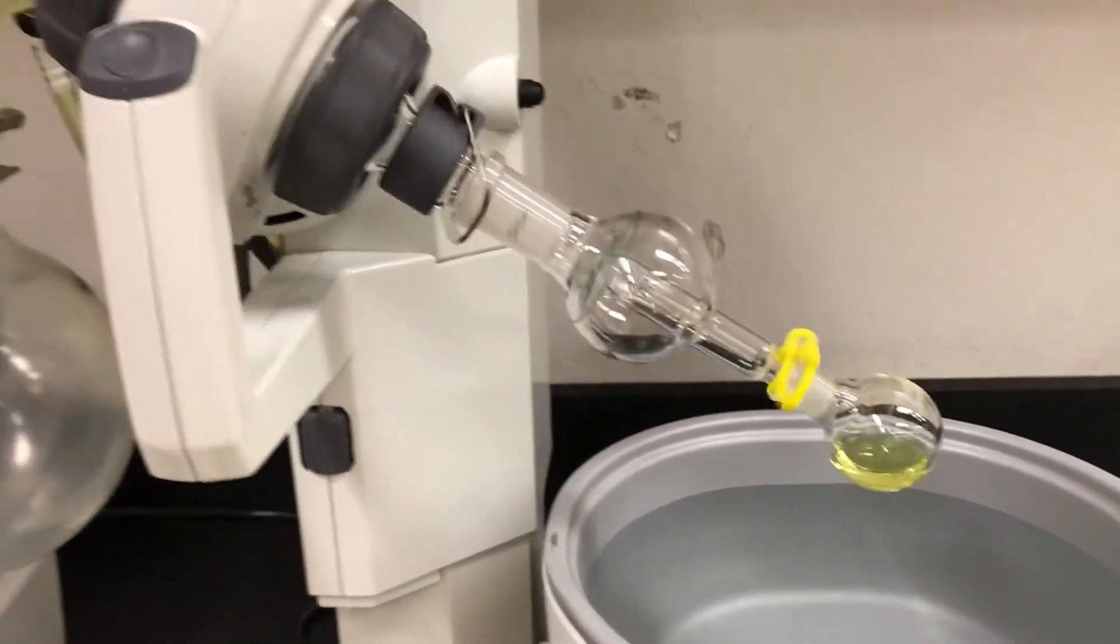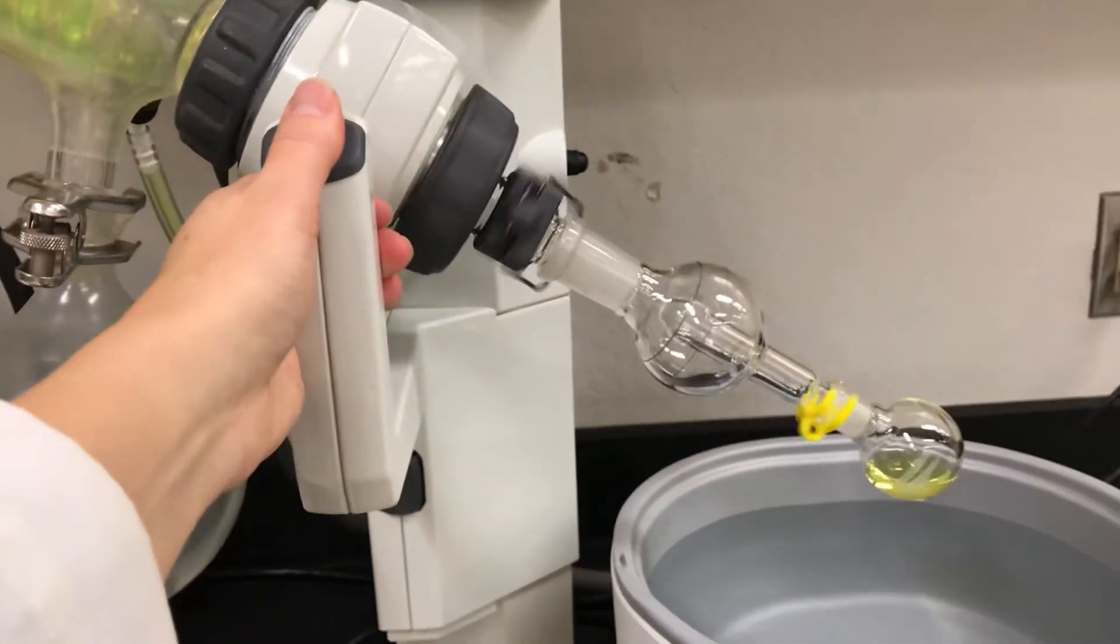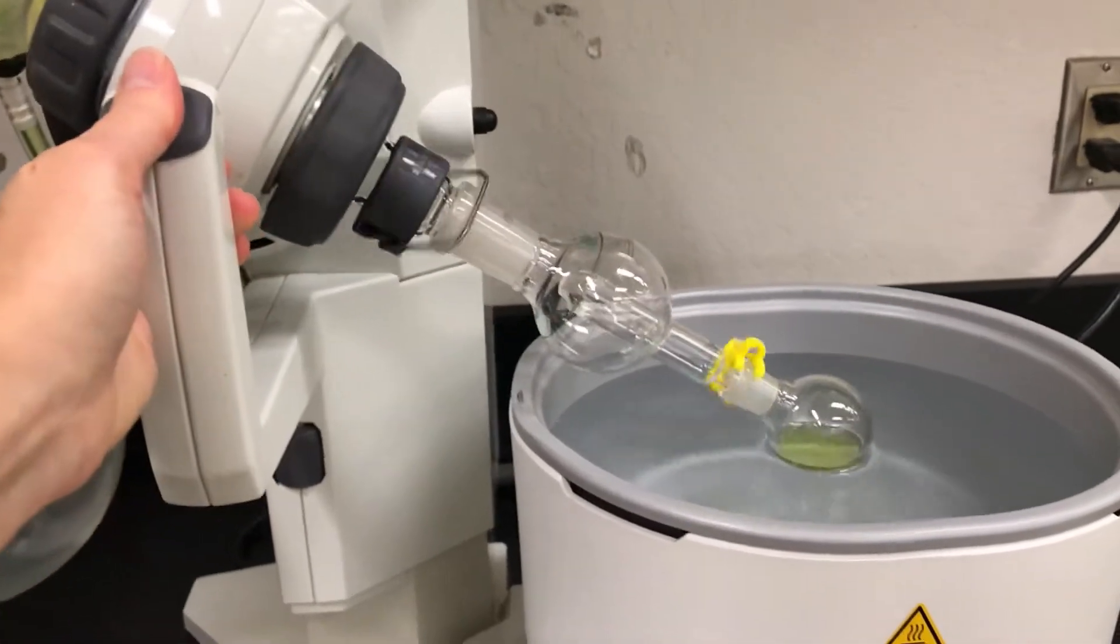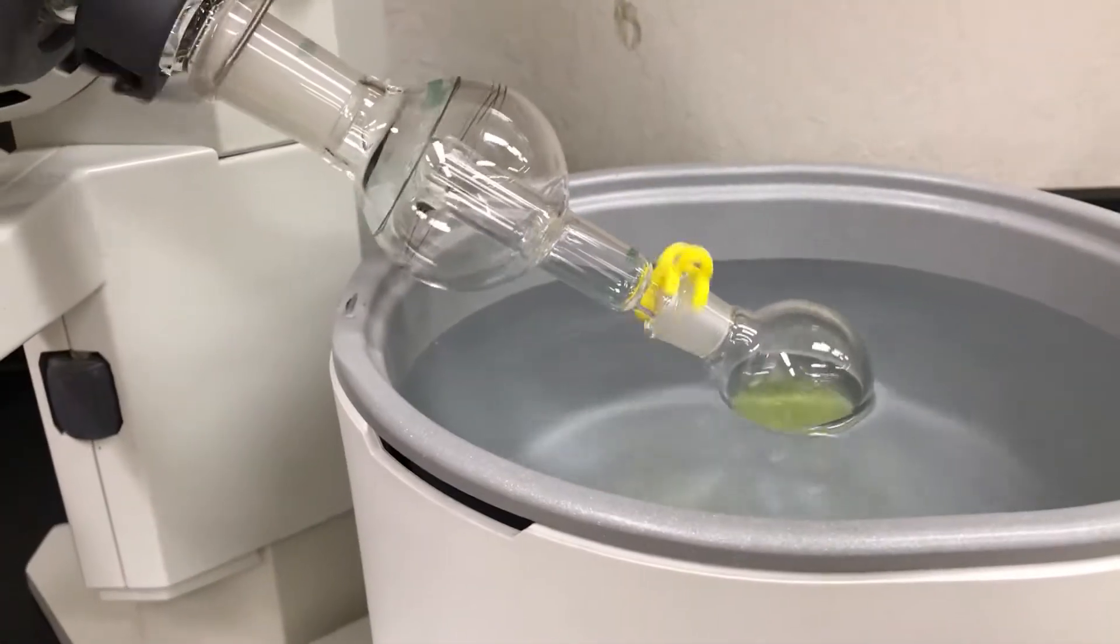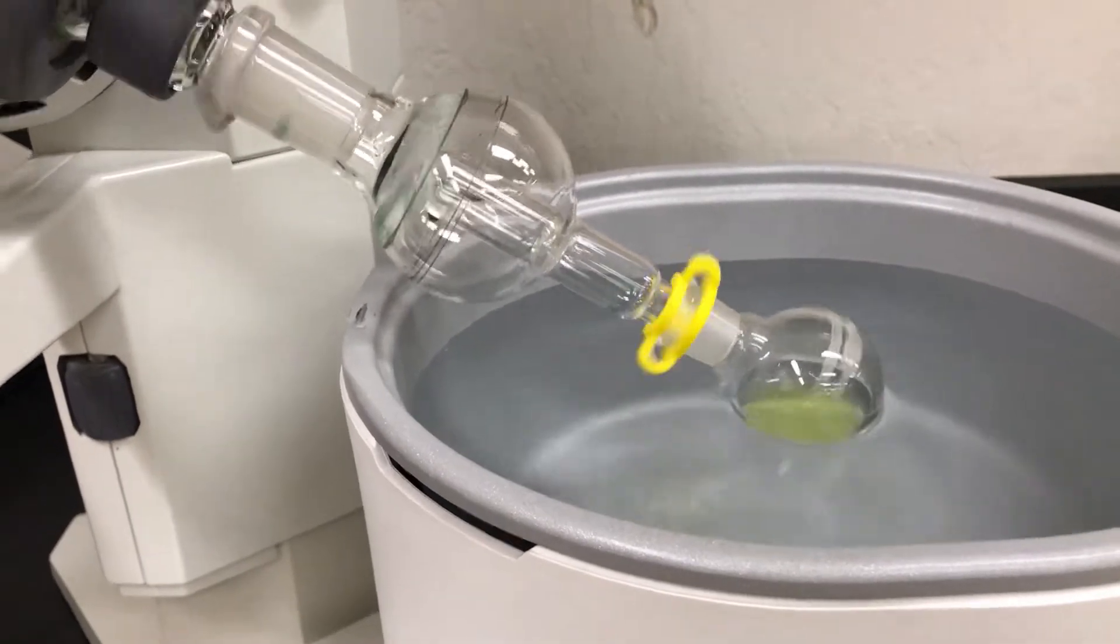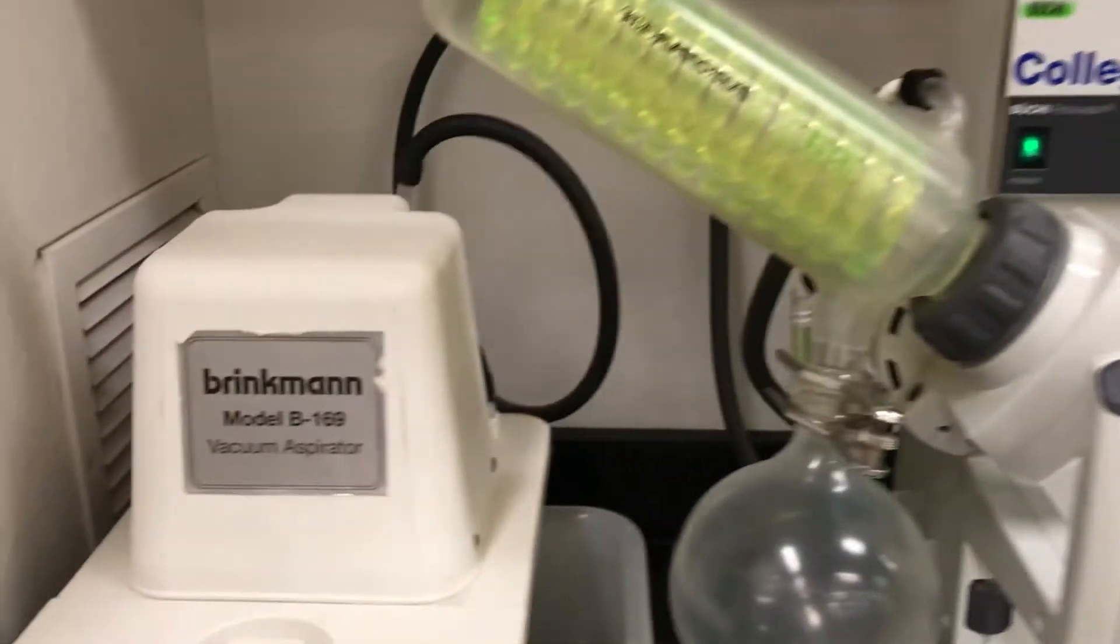You can then take that joystick looking arm and lower the flask into the water. And you do want to make sure that you don't lower it too much because you definitely don't want the joint where that little plastic clip is to be in the water.